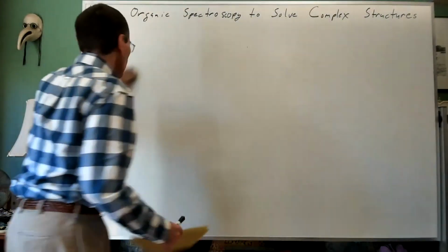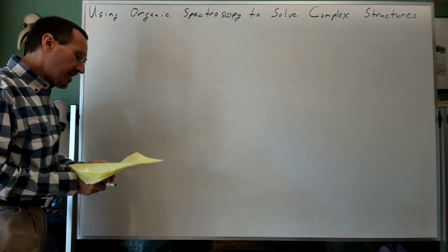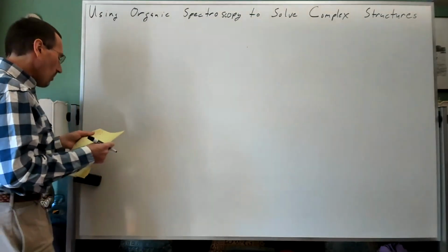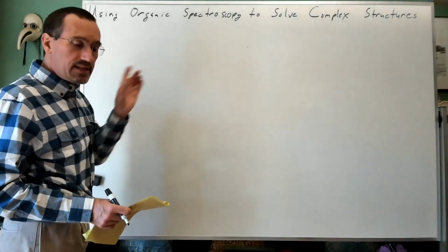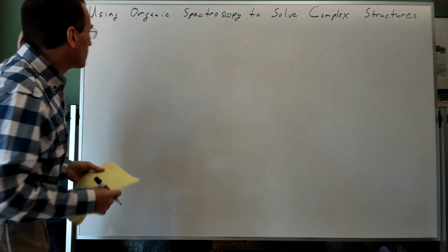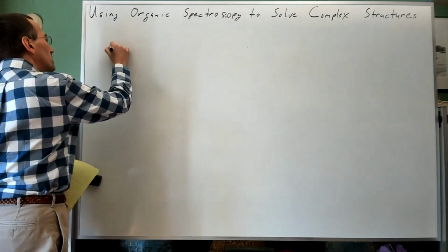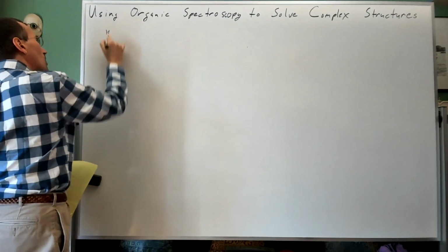It's probably a little bit easier to have a separate piece. This is what I mean by fragments here. And the coupling constant was big. You could see the doublet was quite big for those peaks there. So you could see that rather well. It was 9.9 hertz.